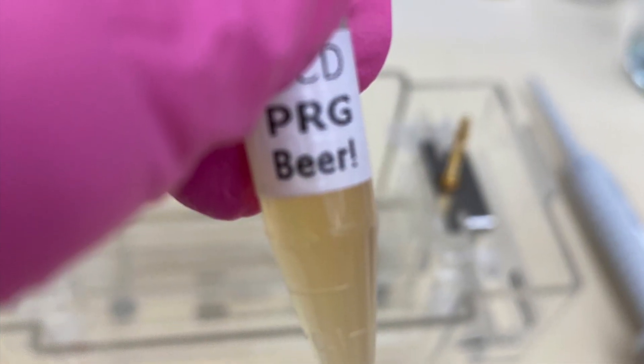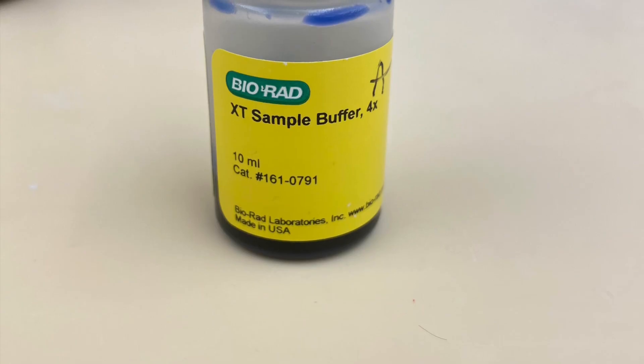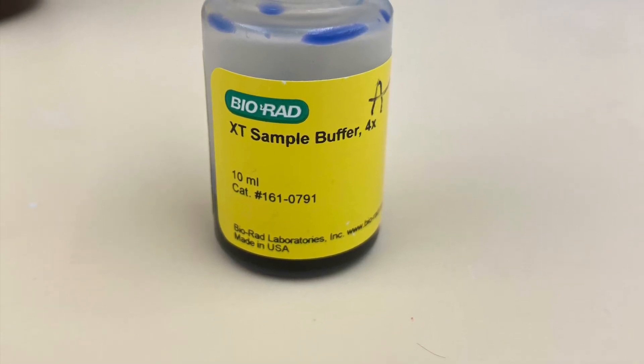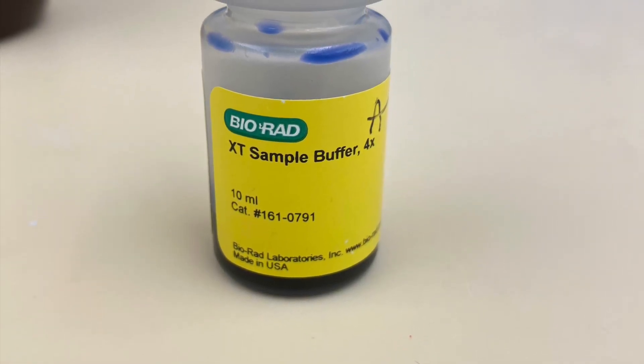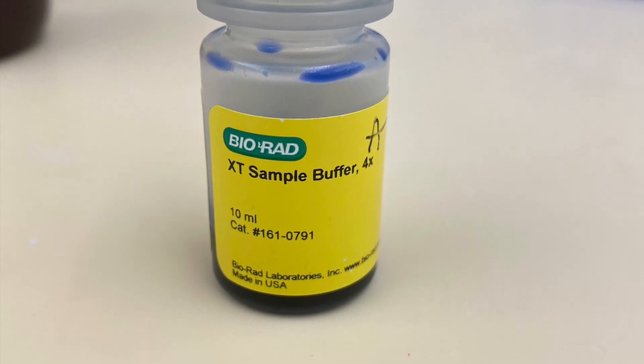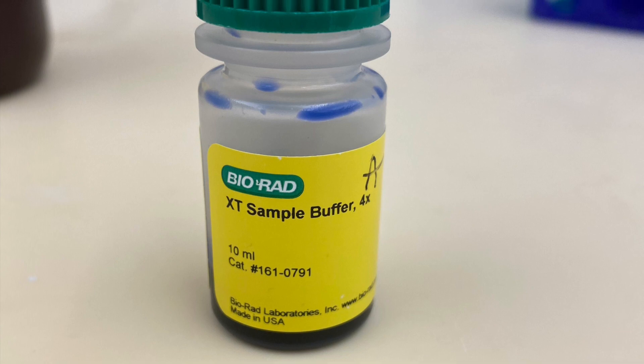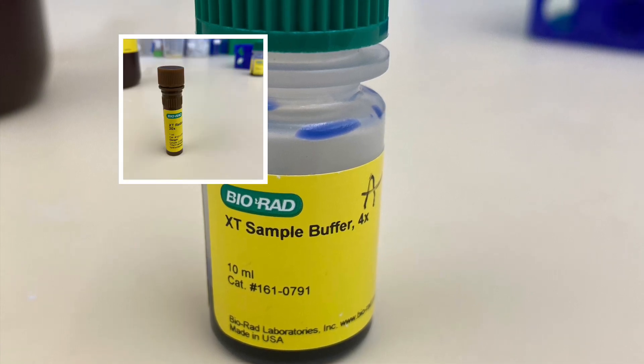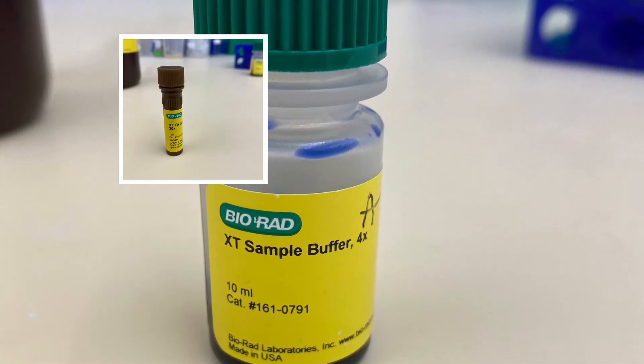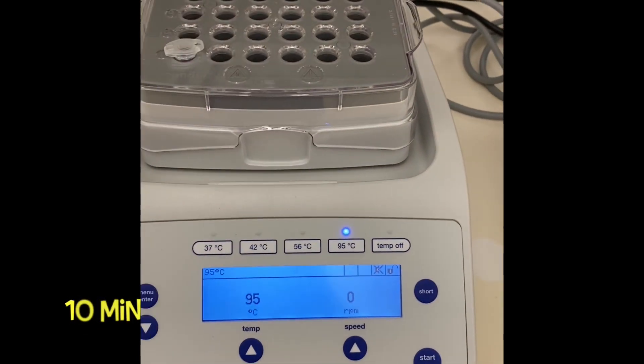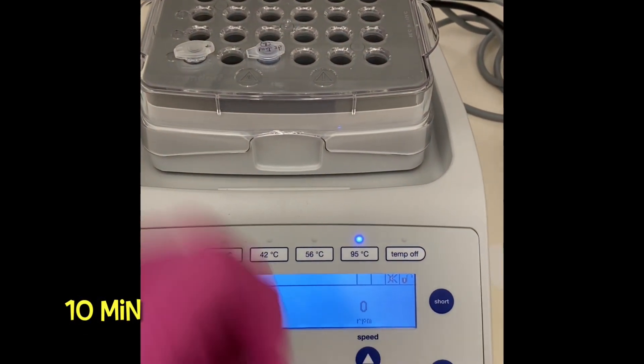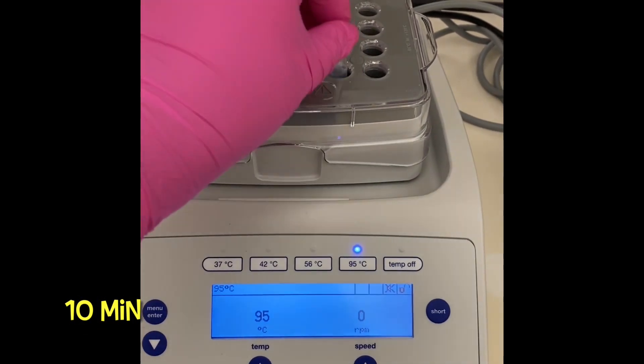Say hi to my beer sample here and I will be mixing it with the sample buffer just like you are doing Western Blot. I'm using XT system from BioRad in my lab so for a sample buffer I'm using XT sample buffer and mixing it with the XT reducing agent. When I mix my sample I will be boiling it for 10 minutes in order to break those disulfide bonds.